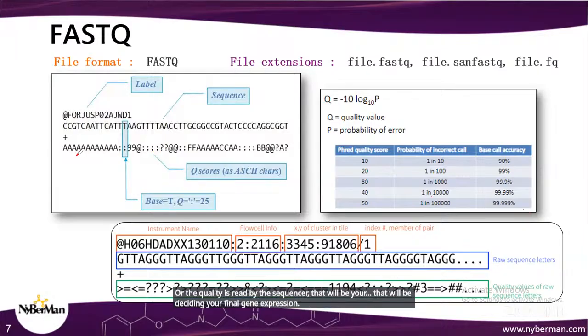But right now, in this form as ASCII characters, we cannot understand what the gene expression is, right? Because these are not in number form or a common format. So we need certain tools to convert these into expression corresponding to gene specific segments.